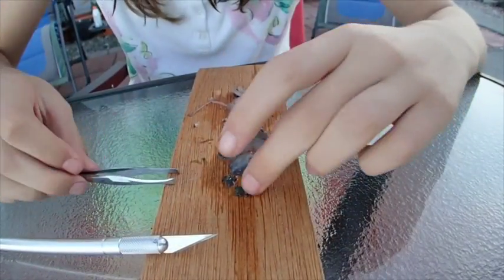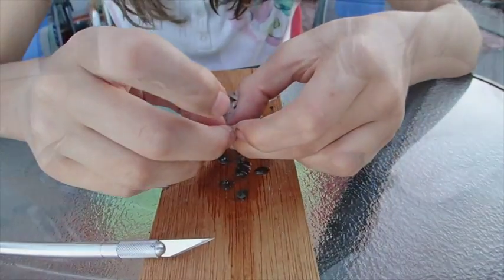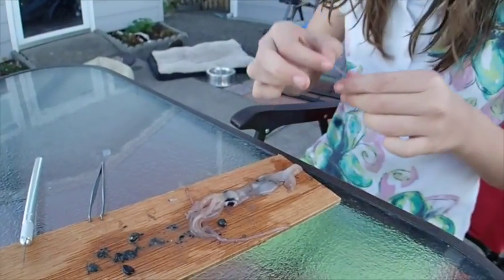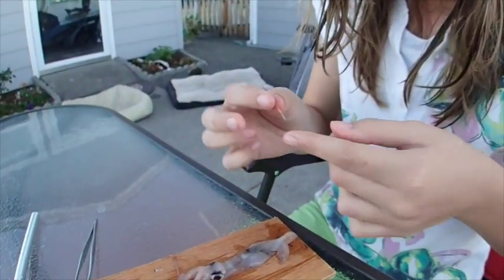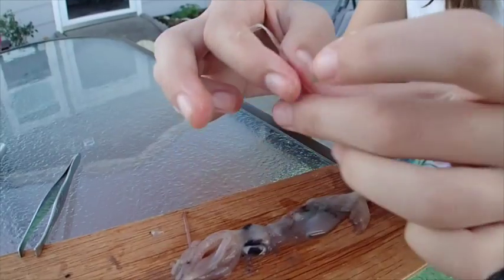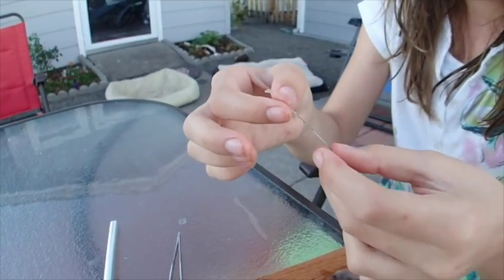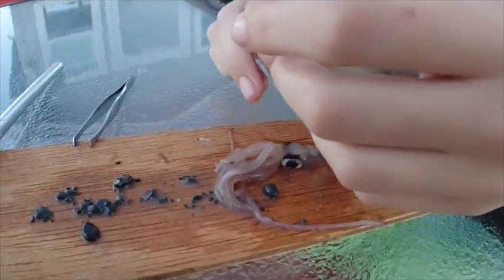Let's try to pull out the feather — this little feather thing on the top. This is supposed to be the feather. See that little point? There it is. It's quite wet right now; we'll let it dry out. This little feather — it's like the spine, pretty much.